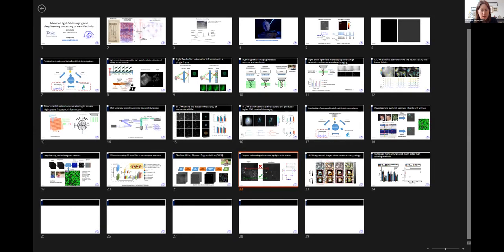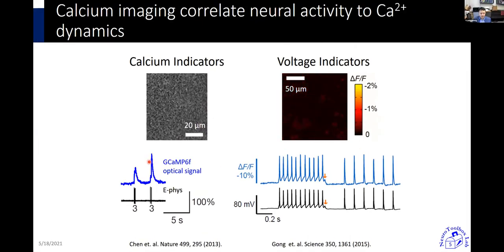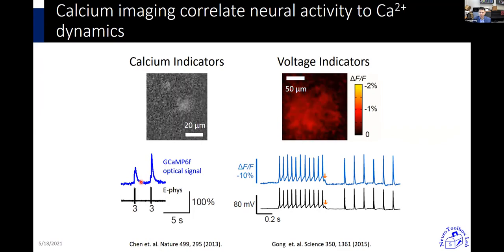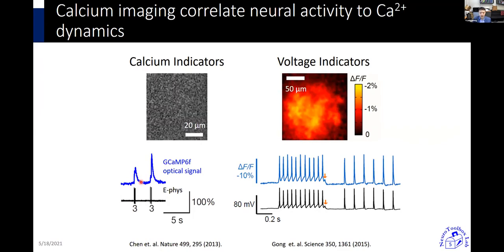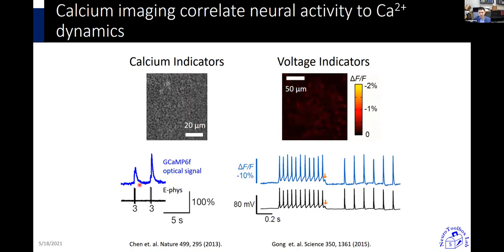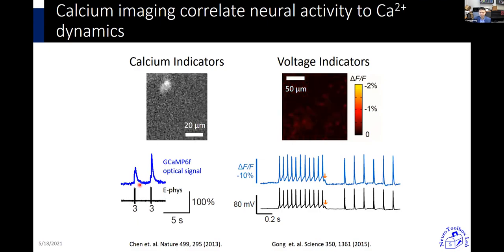So it turns out we know what the calcium response of lots of neurons is. When neurons fire, this is the actual action potential, and this is the calcium response. It's a very stereotypical fast rise and then exponential decay, no matter how many action potentials there were. So the temporal waveforms that we expect are these types of fast rise and exponential decay. What we programmed into the algorithm was a filter that matched exactly this waveform and looked for specific things that looked exactly like this waveform in time within the movies.